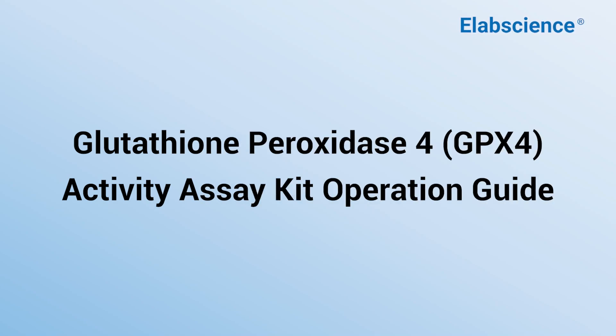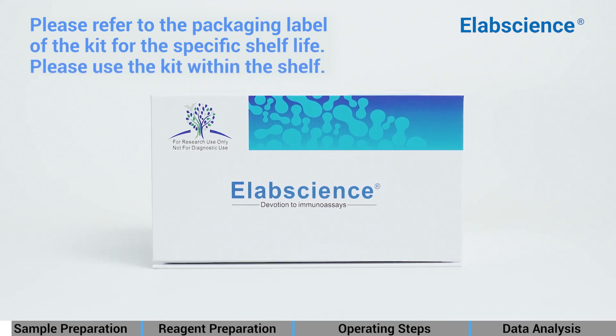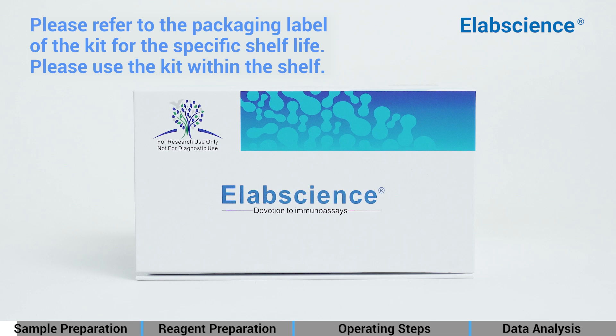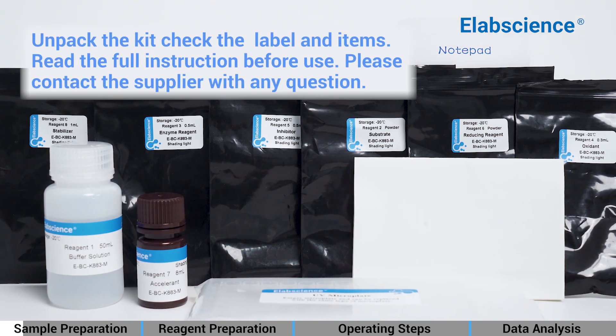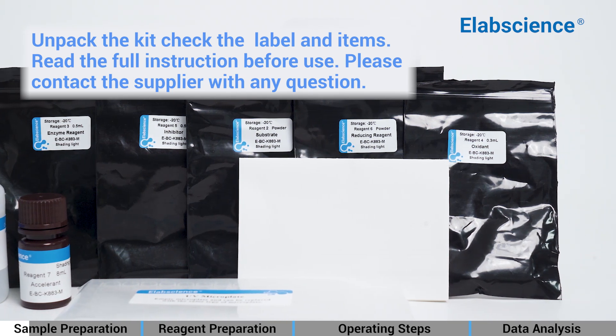Glutathione Peroxidase 4 Activity Assay Kit Operation Guide. Please refer to the packaging label of the kit for the specific shelf life, and use the kit within the shelf life. Unpack the kit, check the label and items, and read the full instructions before use. Please contact the supplier with any questions.